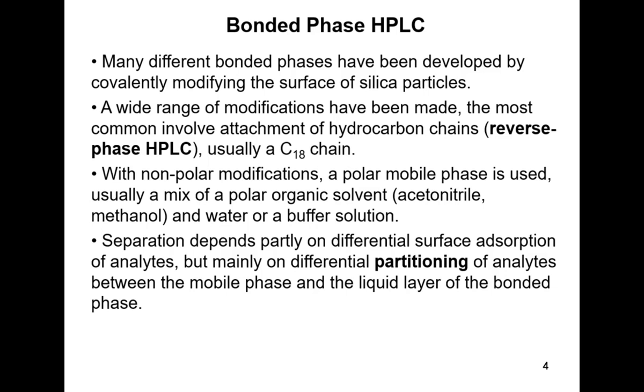And this is a bit more complicated because you can have some kind of adsorption processes, mainly van der Waals interactions with the hydrocarbon surface, but you can also think about the bonded molecules as like a very thin layer of liquid. So the molecules are partially dissolving in that bonded layer of hydrocarbons. So you can think about it as a partitioning process between the polar mobile phase and the non-polar stationary phase liquid.